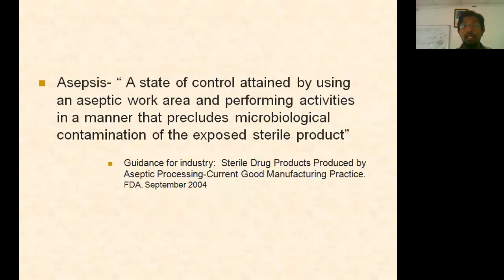So asepsis means a state of control attained by using an aseptic work area and performing activities in a manner that precludes, it means excludes, it means removes, microbiological contaminations of the exposed sterile product. So this is called asepsis, a state of control attained by using an aseptic work area and performing activities in a manner that precludes microbiological contaminations of the exposed sterile products, right?